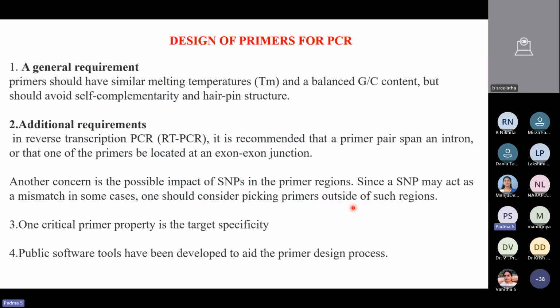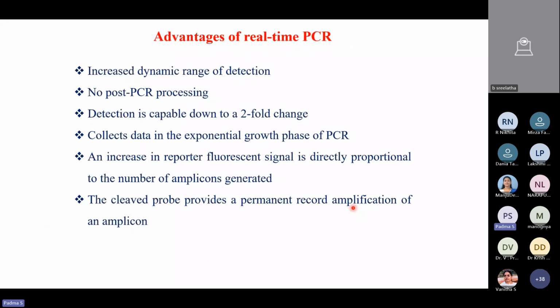Now we have seen the pros and cons of doing a PCR reaction, whether you should choose a quantitative PCR or a qualitative PCR. That depends upon our choice. And now, once we have decided to go ahead with PCR, you require to design primers.